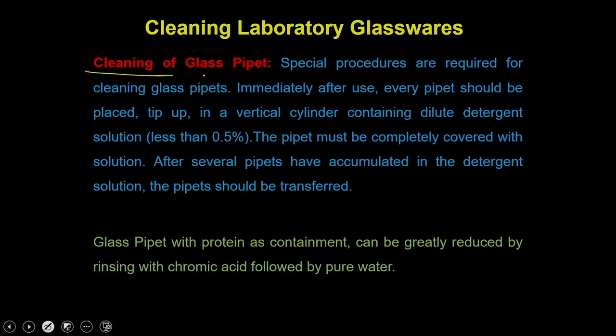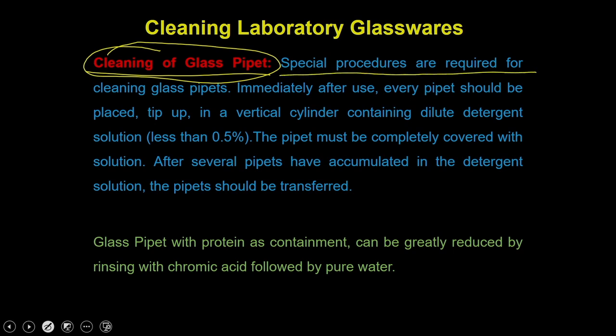Then the cleaning of the glass pipettes. If you remember in the previous section, we discussed how to use the liquid handling system. Once those liquid handling systems become dirty, you have to clean them. So special procedures are required for cleaning the glass pipettes.